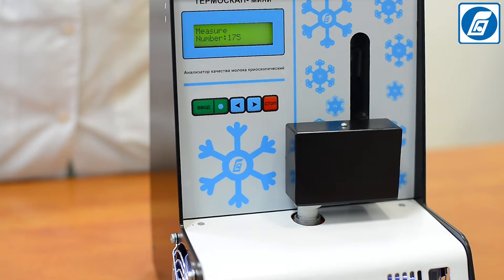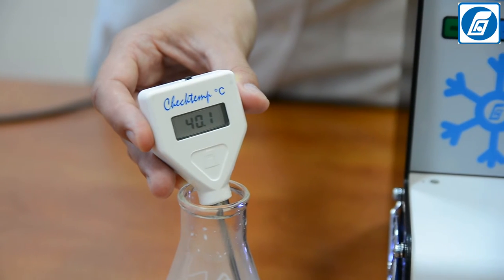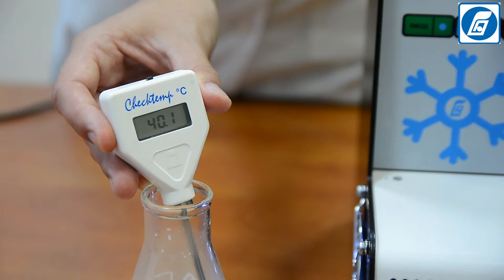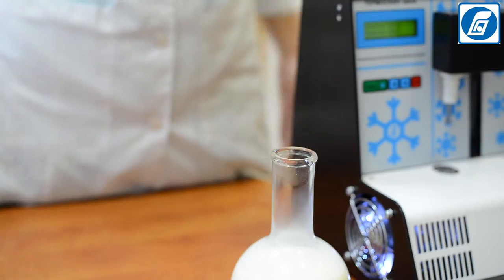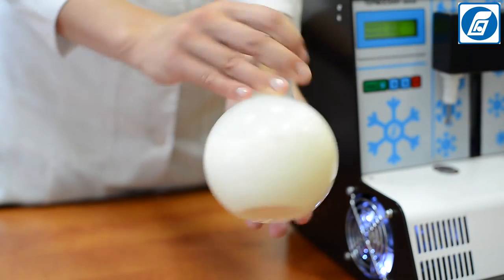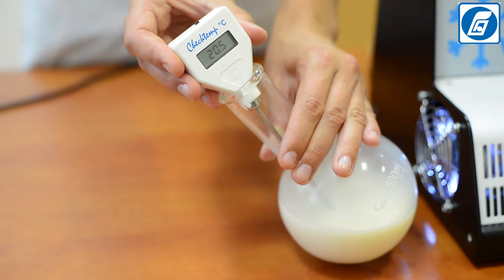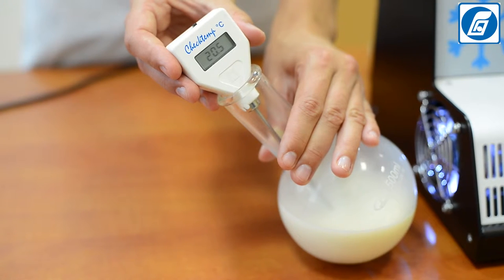If crystallization of the milk sample begins before the established temperature is reached, the cause is likely the presence of crystallized fat formed during cooling. Preheat the milk sample on a water bath to +45°C, keep it at this temperature for 5 minutes to melt the crystalline fat, then cool it to +20°C and immediately perform the measurement.